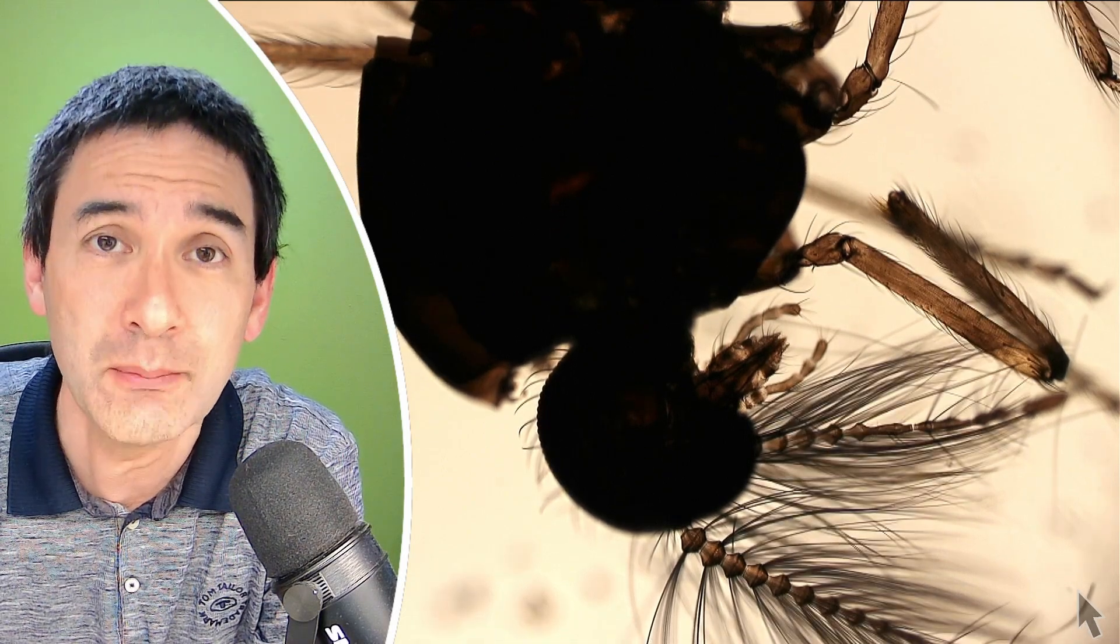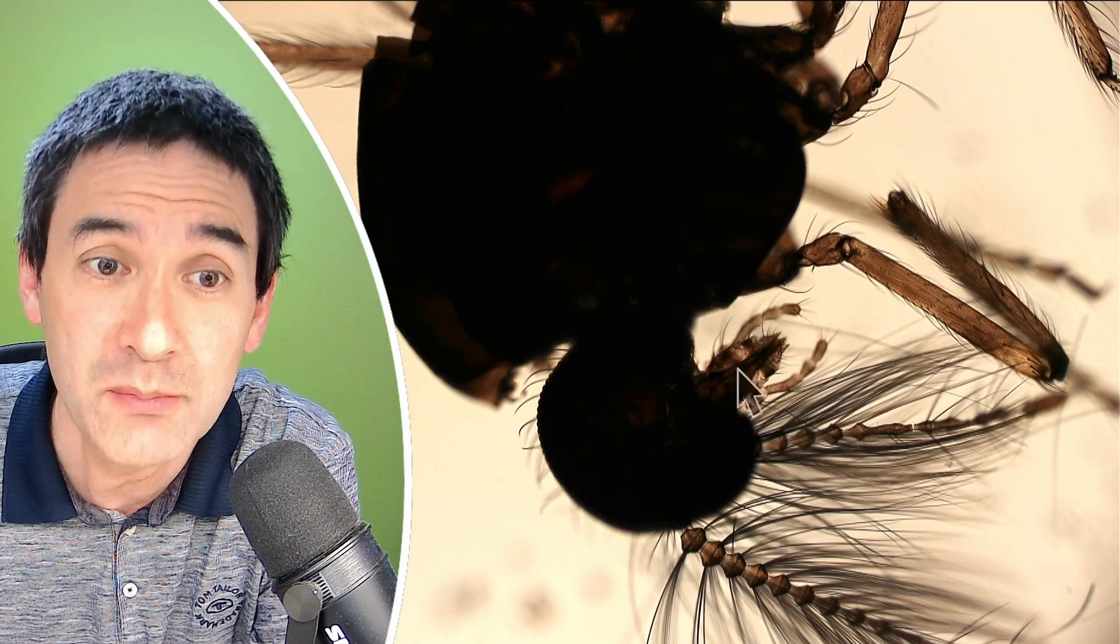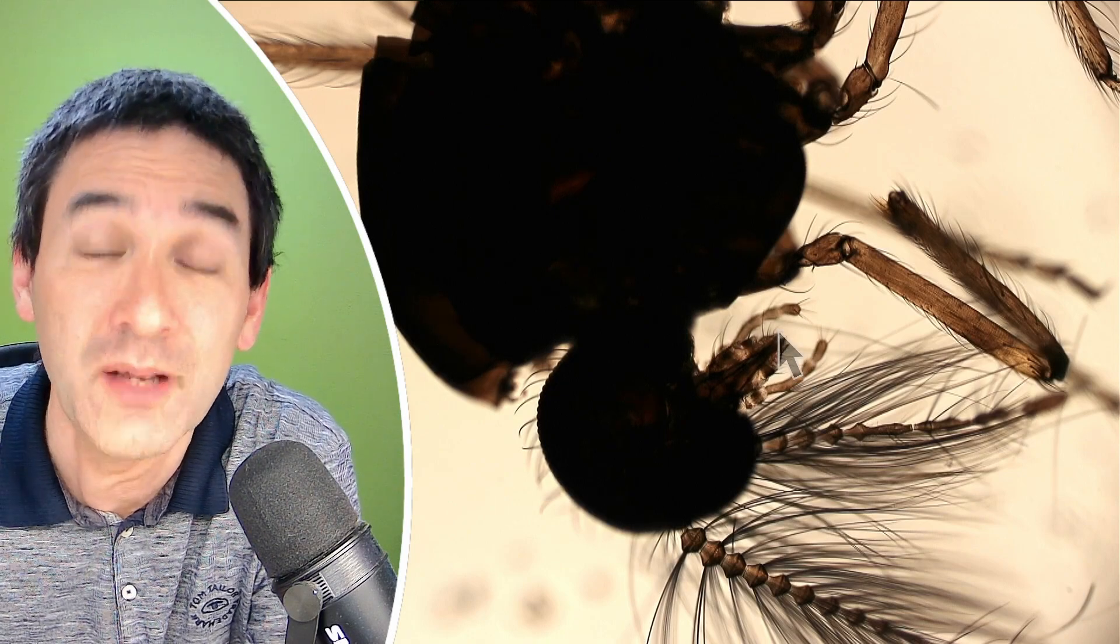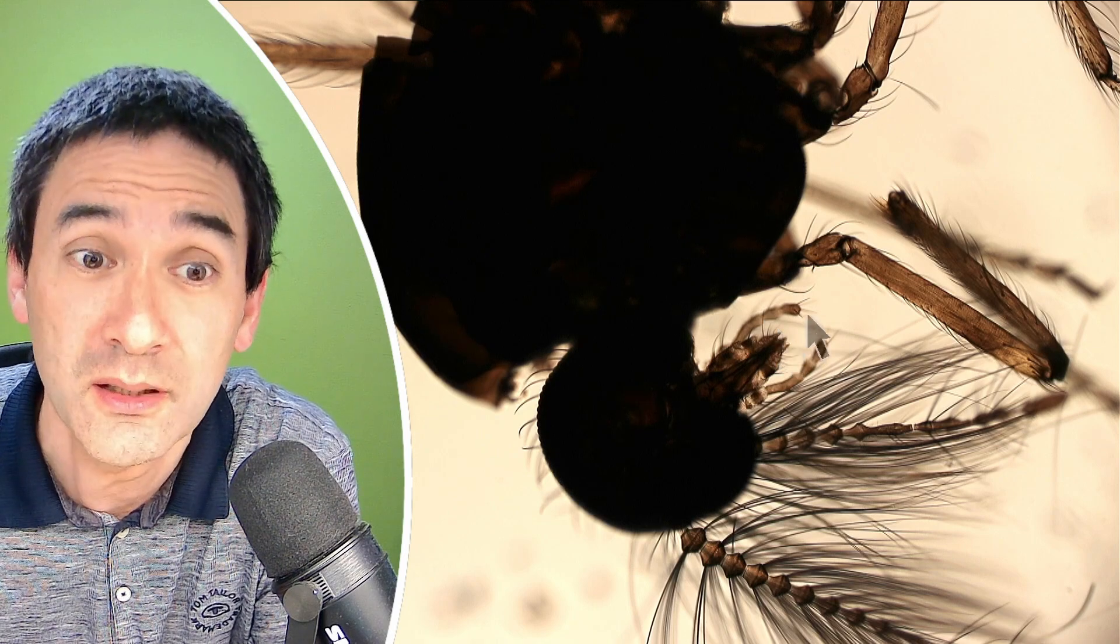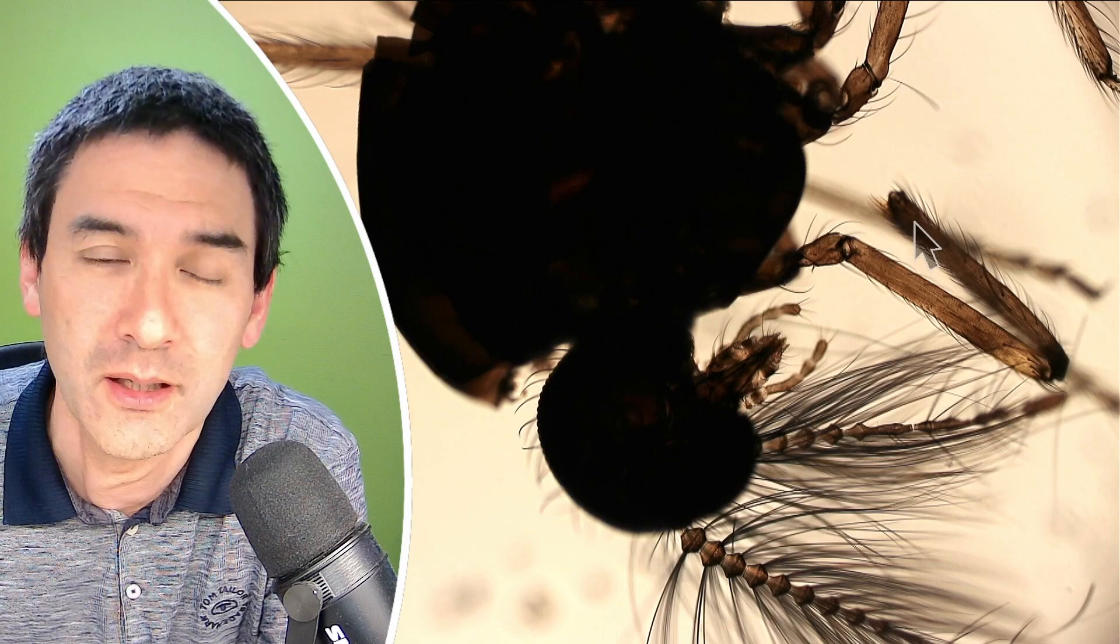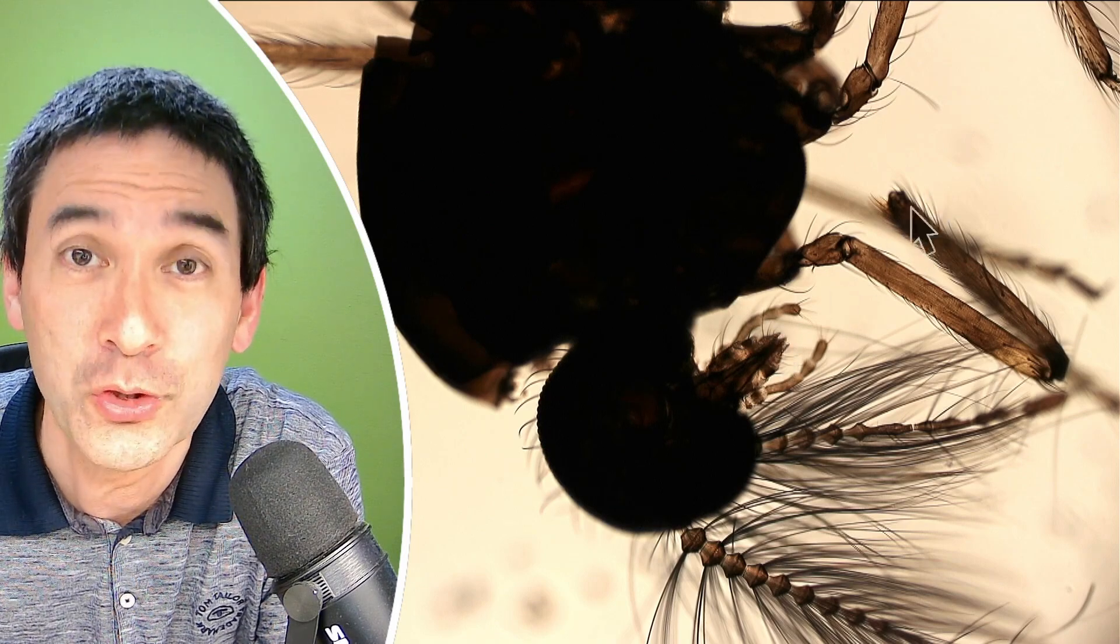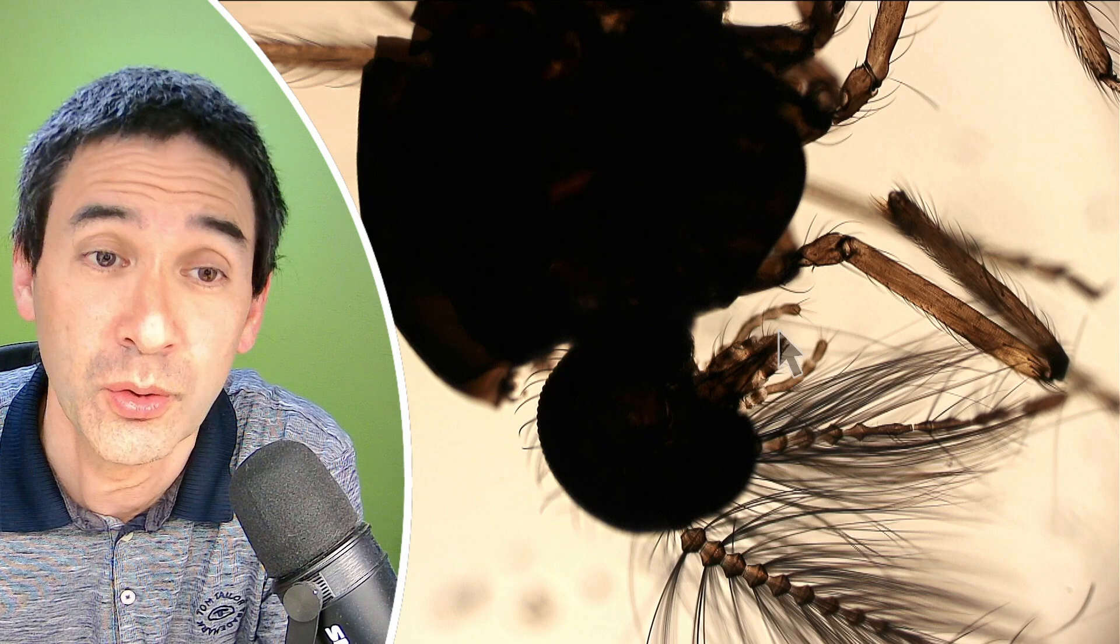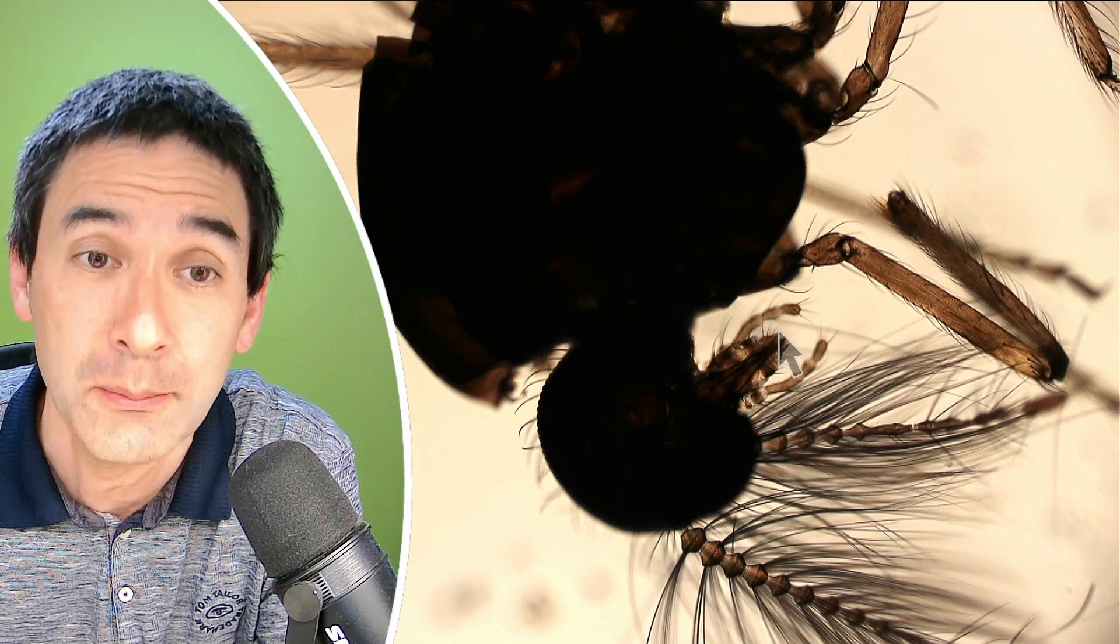The reason why I was able to find out that it's actually not a mosquito is by looking at the mouth parts here, because mosquitoes, female mosquitoes at least, are blood-sucking and they have this long extension called proboscis. And this one does not have those, right? So evidently it's not sucking any blood.